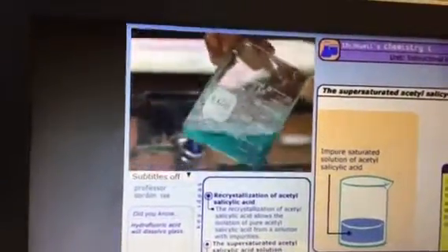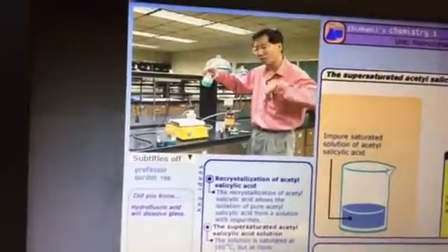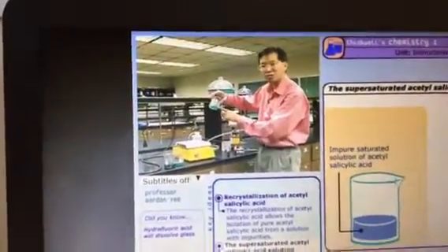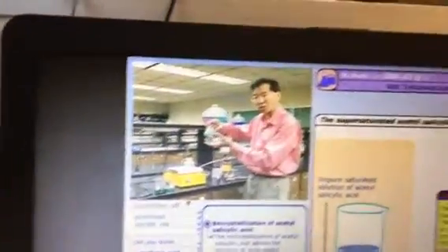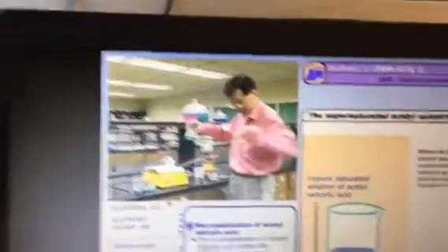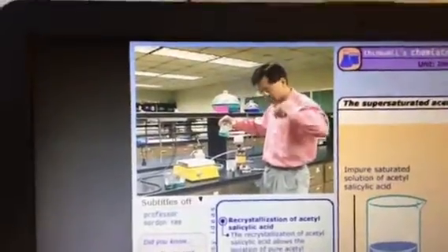Now, the crystals are not as nice as these crystals, but they're still nice crystals, and the point that I want to make is that if we have been able to effect a purification here, then when we collect the crystals, the food coloring ought to go with the water, and so the crystals ought to come out perfectly colorless again, just as the crystals of the sugar are perfectly colorless. So let's take a look.